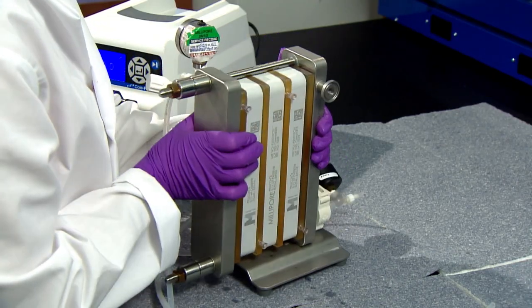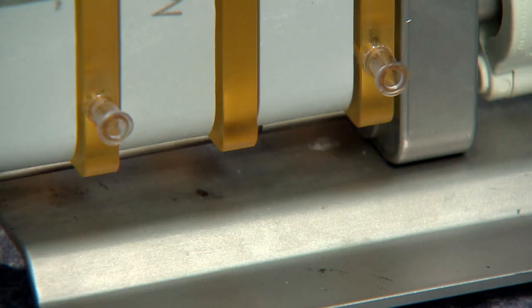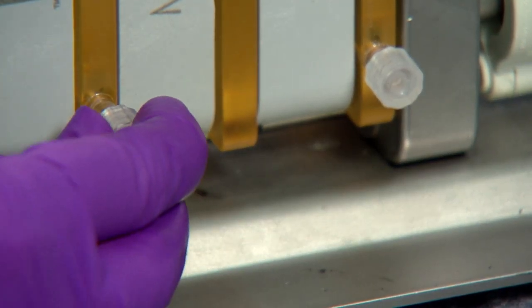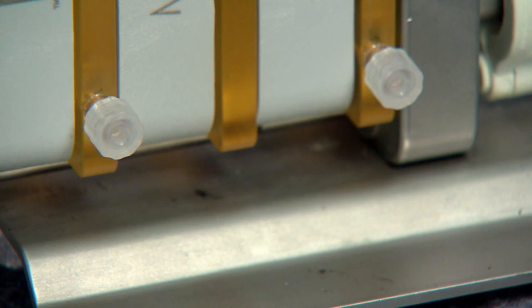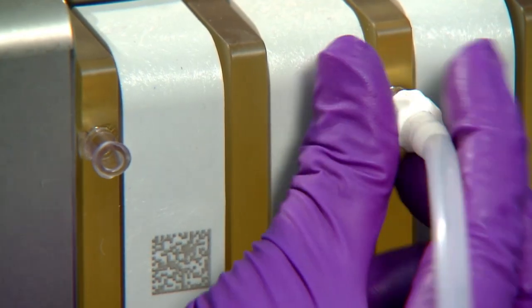Turning the holder around, you will do as you had for the front by capping off the retentate ports, now located at the bottom, and connecting permeate collection tubes to each permeate line.